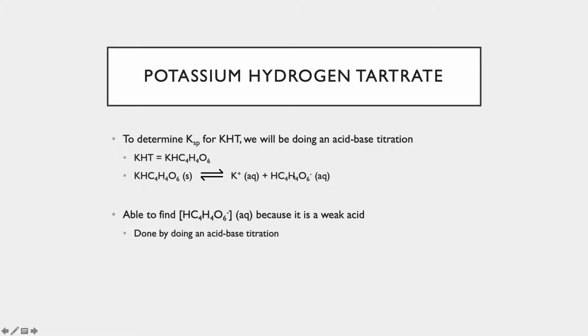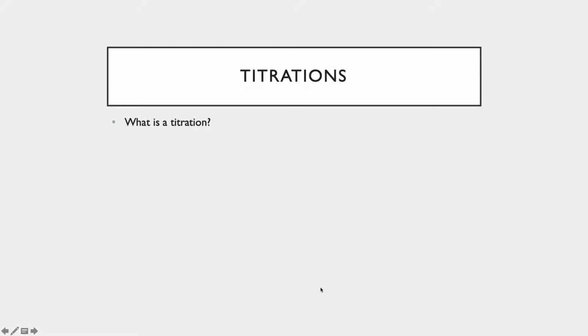And so what we're able to do is an acid-base titration, is what we call this. What that's going to involve is reacting hydrogen tartrate with sodium hydroxide. And for every hydroxide that reacts with the hydrogen tartrate, we're going to get just a tartrate ion, and we're making water. So it's the fundamental neutralization reaction that's happening: we have some sort of weak acid with a proton, and our hydroxide making water. That's the general reaction that's going to be taking place there.